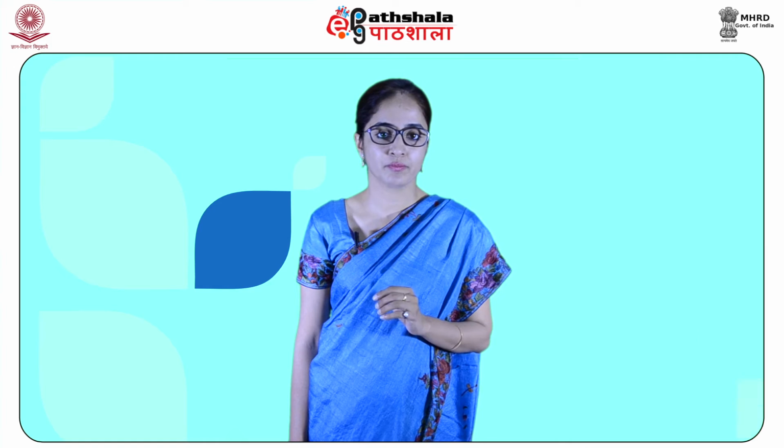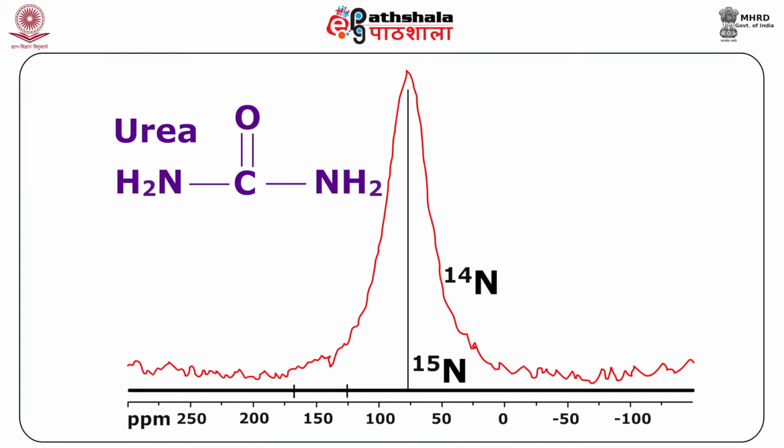Sensitivity is made worse by its low gyromagnetic ratio, which has a value of -27.126 into 10 to the power 6 Tesla inverse second inverse, which is 10.14% that of 1 hydrogen, that is proton. The signal to noise ratio for proton is about 300-fold greater than 15 nitrogen at the same magnetic field.